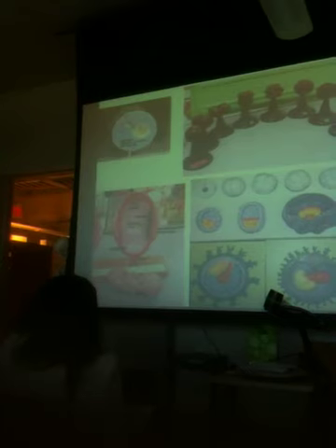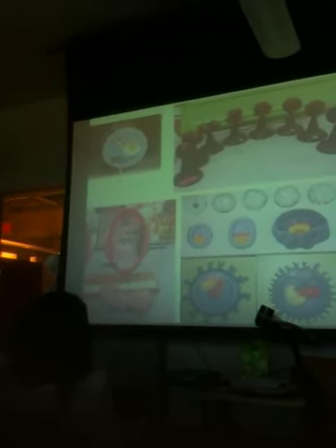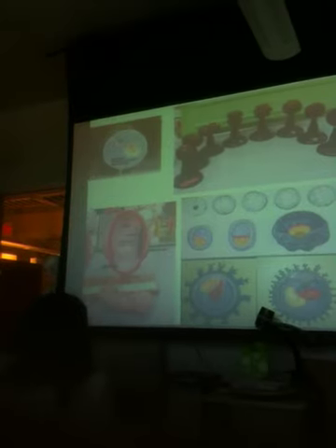And this is just showing you the fertilization. Here's the flagellum of the sperm. There's the nucleus of the sperm with its 23 chromosomes about to fuse with the 23 chromosomes of the egg. So when these come together, you have a zygote. And I'll stop here because the rest of these are all fertilization pictures that we're going to be doing next week, except for that.